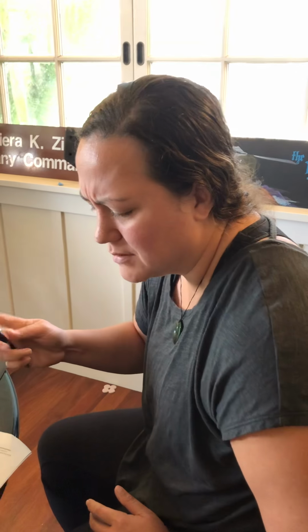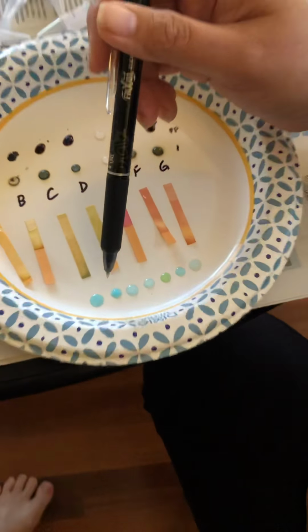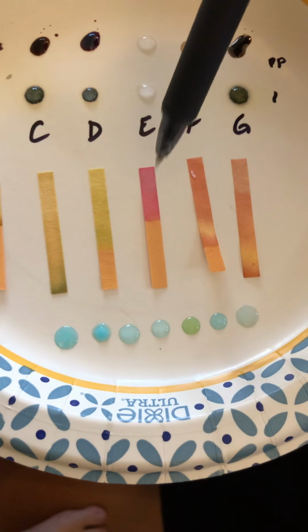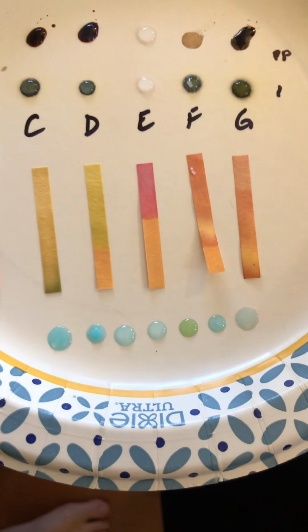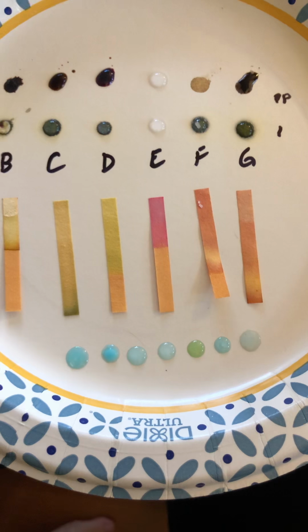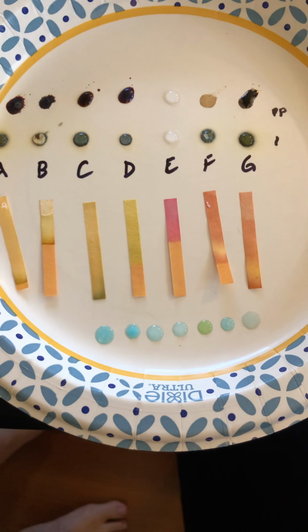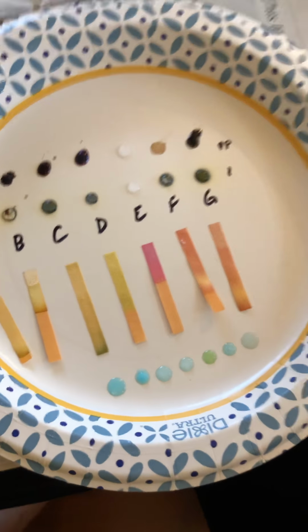Something I forgot to talk about down here on the reagents: I noticed that only one of them reacted, which was E. And E, I had guessed, was ascorbic acid. When I went back to look at the structure, it also was the only one that had an alcohol on a carbon bonded to a carbonyl. So that, to me, at least locked in ascorbic acid, probably the only one I'm really sure about.